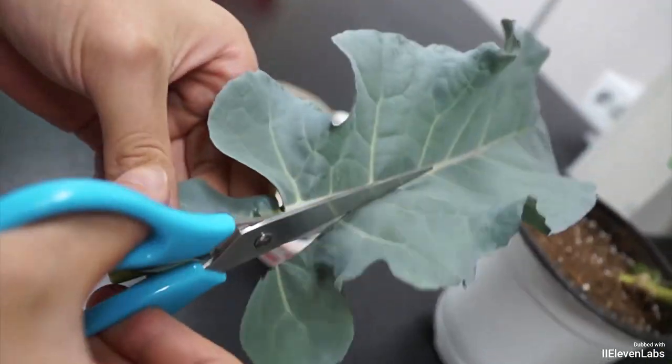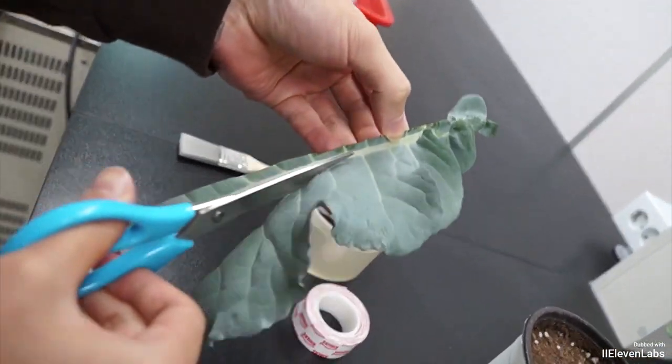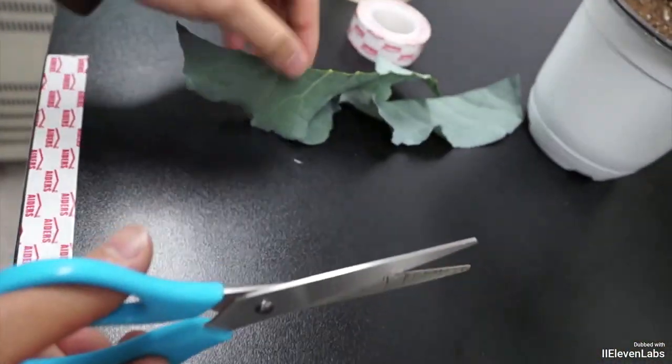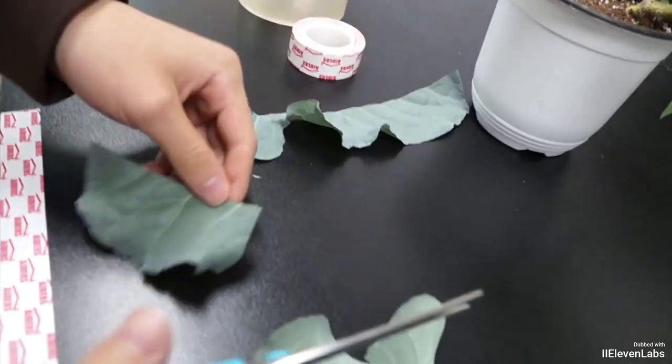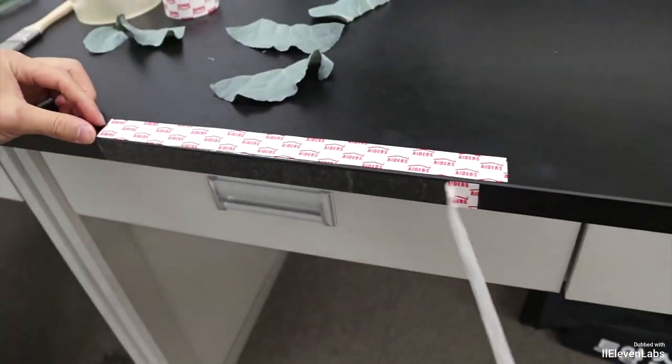First, take a broccoli with well-developed wax and carefully cut the flattest part, avoiding the veins of the leaves. Next, attach the cut broccoli leaves to the double-sided tape you prepared in advance.